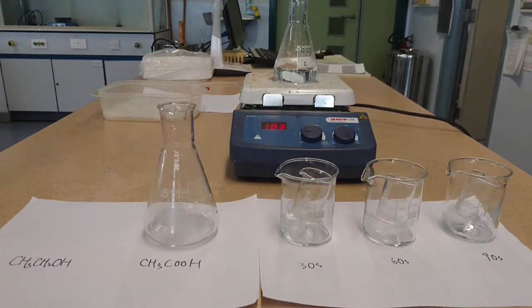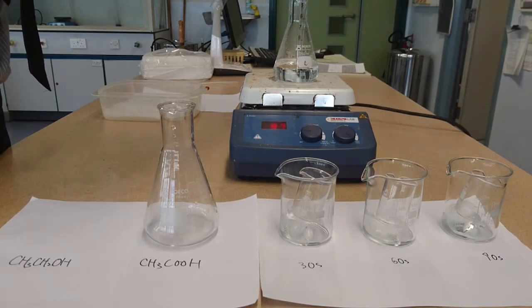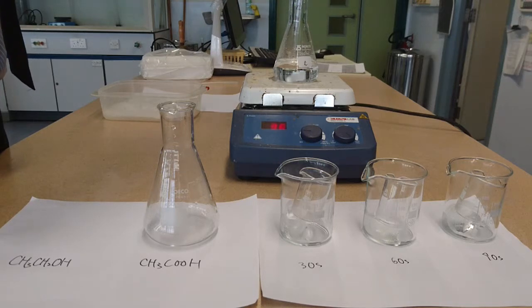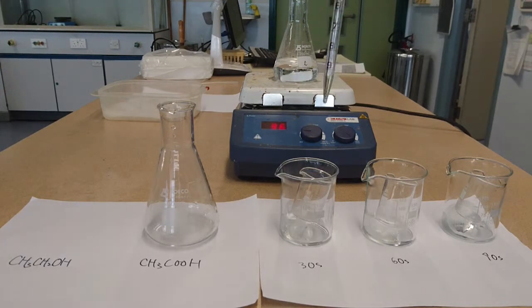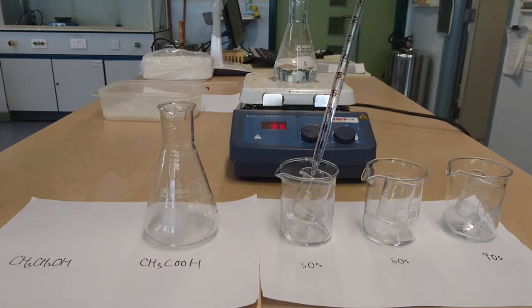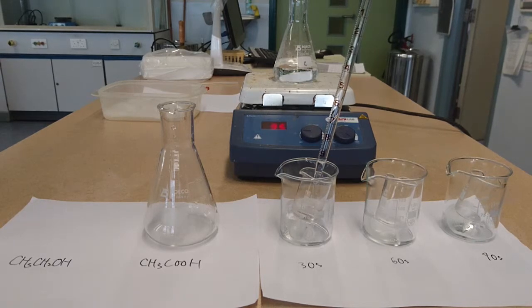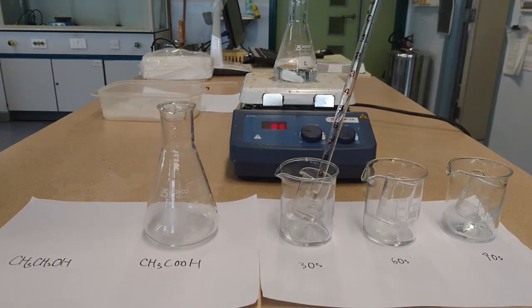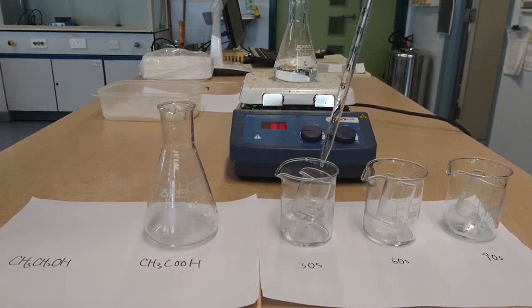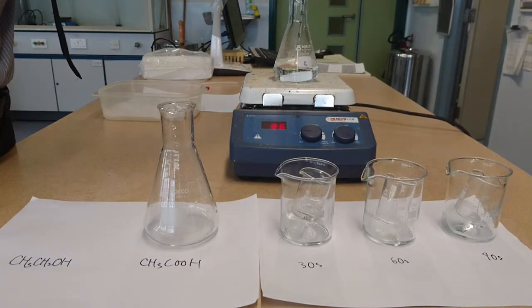Now, I would like to pick 10 cm cube of the reactant out. So I use this pipette and get 10 cm cube out. Alright, and what I should do next is put it into the small beaker here, which is ready. And it is cooled by the ice. So we will say that the reaction is being quenched in this way. And then 10 seconds more. Now, I get the solution.